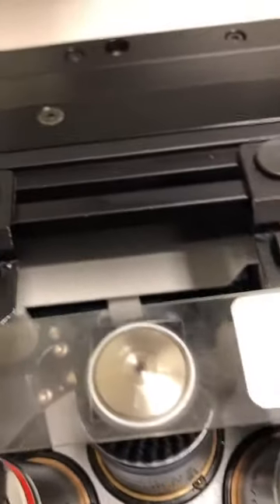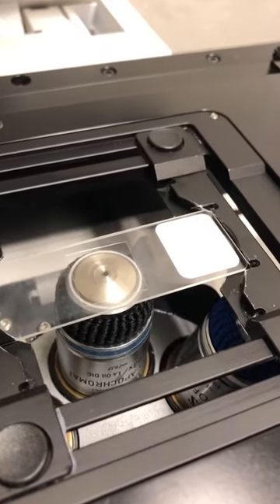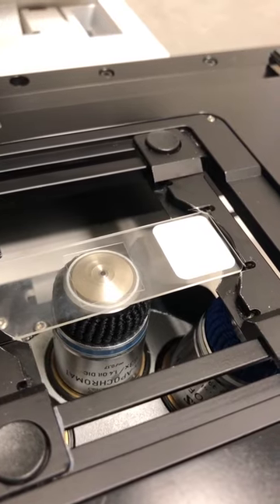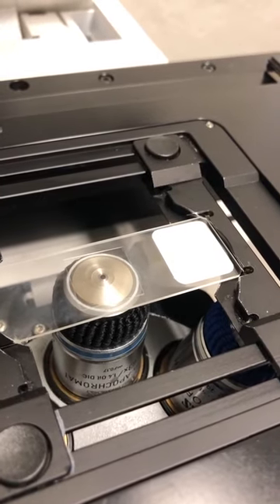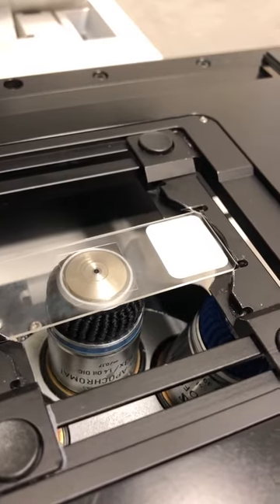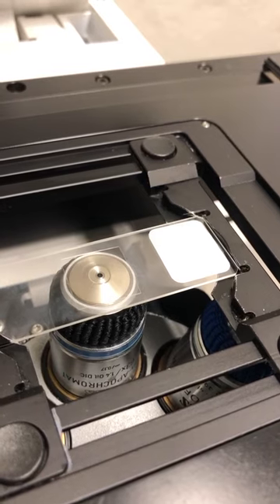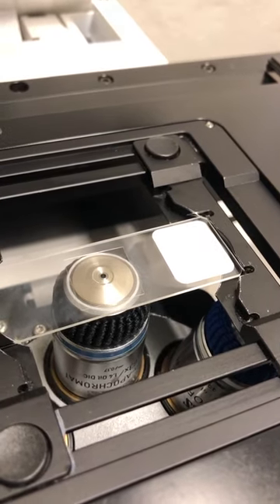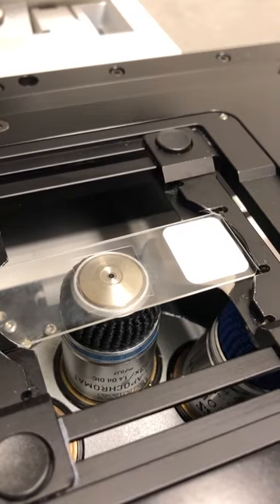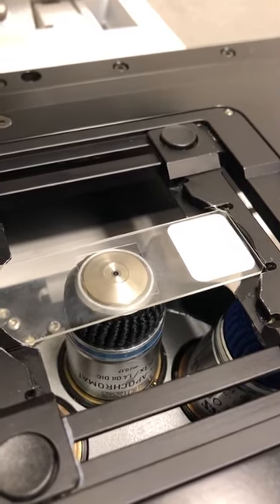In this case the oil is not touching the sample, so I'm going to raise it by moving the focus knob away from me until the oil does touch. There we go — you can see the oil touch the sample. You can tell because if I move the focus knob towards me the oil slick gets smaller, meaning the objective is going down. If I move it away from me the objective goes up and the oil slick gets bigger.